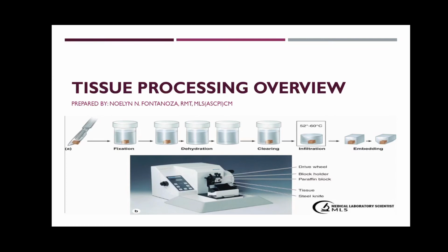Good day, everyone. For today's topic, I will be teaching you how to properly process your tissues in the histopath lab. But in order for you to have a grasp of this subject, you need to know them by heart first before getting into details. So today, we will just be tackling the overview of the different steps in tissue processing.